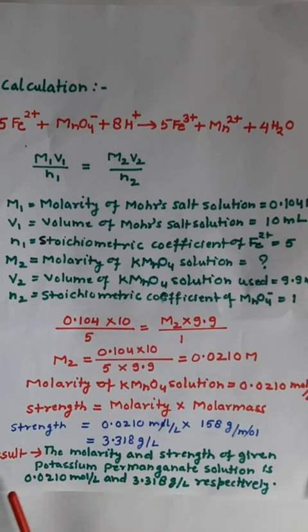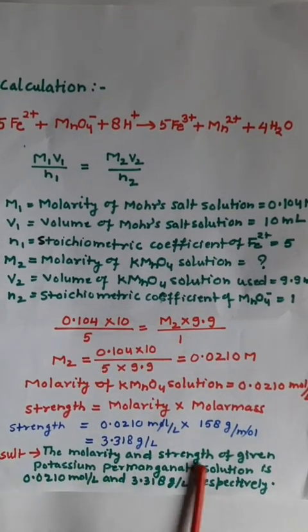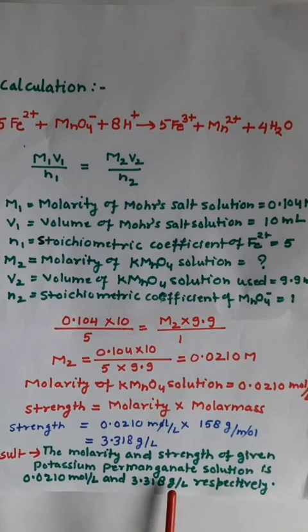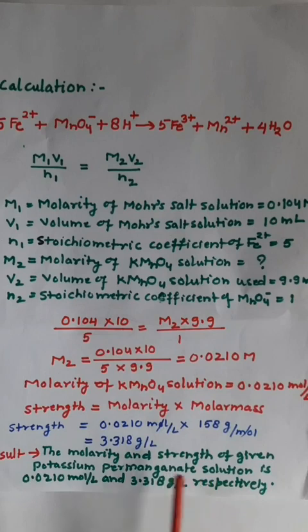Now, in the result, you have to report that the molarity and strength of the given potassium permanganate solution are 0.0210 moles per liter and 3.318 grams per liter respectively. In this way, we can calculate the molarity and strength of the given potassium permanganate solution.